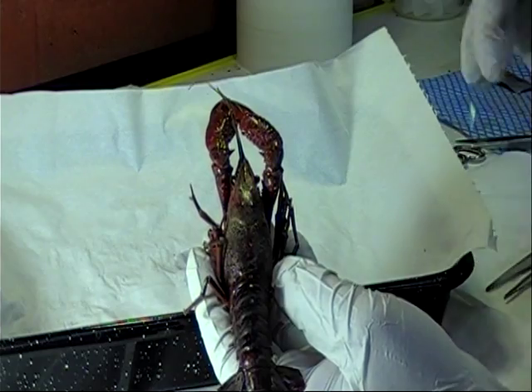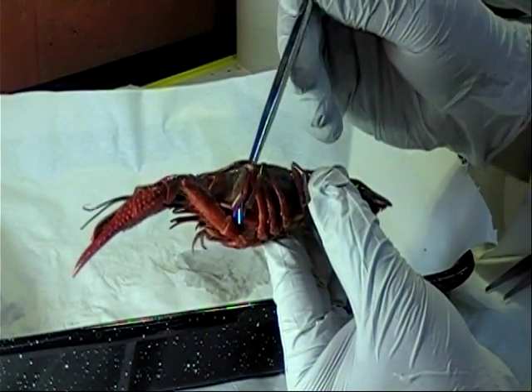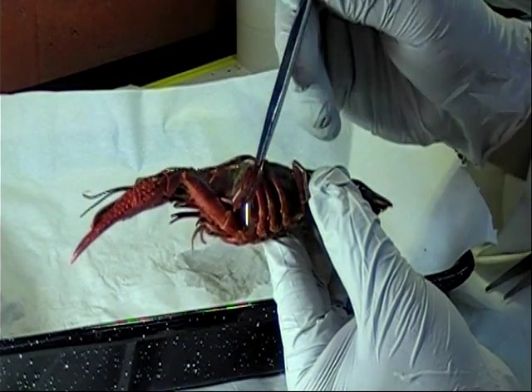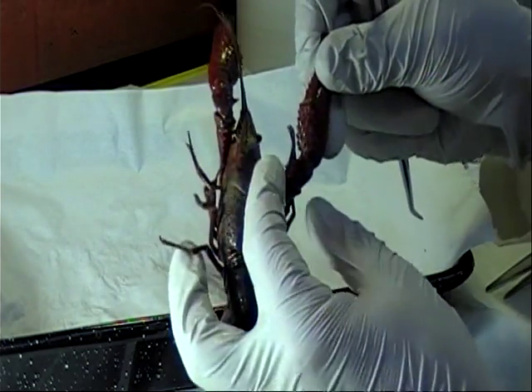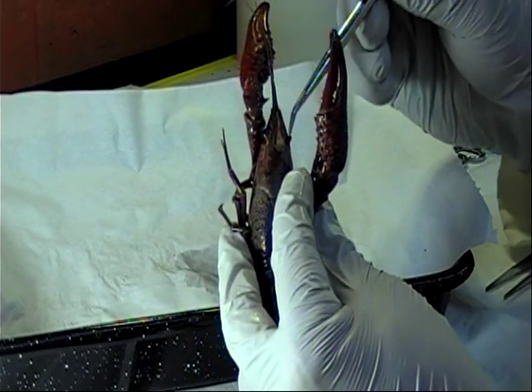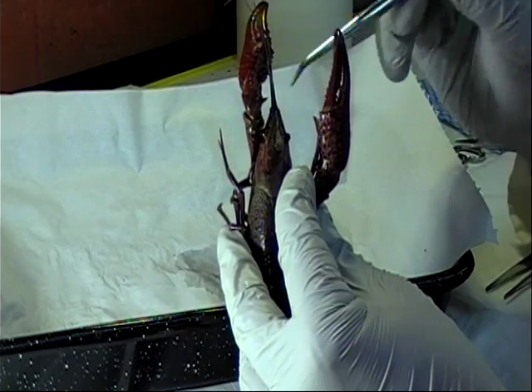Turning now to the lateral side, we can see that the carapace extends right to the underside of the crayfish. Looking now to the head, we can see the eyes of the crayfish and the rostrum, which is an extension of the crayfish's carapace, used for protection.